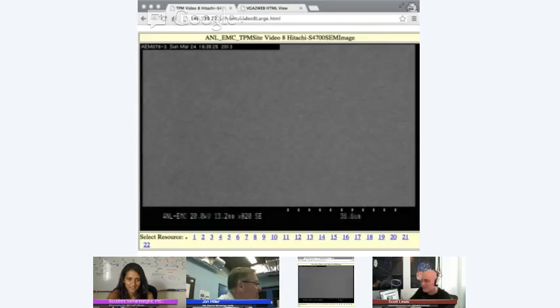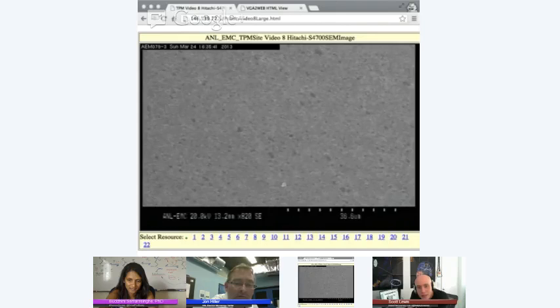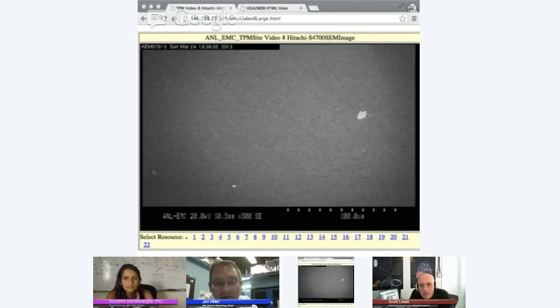Okay, it's still moving around. And so just to give you an idea of what the sample is, it's a very simple sample. It's gold on carbon, and it is what us microscopists use as a resolution standard. So we actually use this sample to test the ultimate resolution of the microscope. Gotcha. Okay? And I'm going to zoom out here. Let me refresh this background image. And so we see some flakes of dust, okay? 100 microns. So 100 microns is typically the thickness of a human hair.